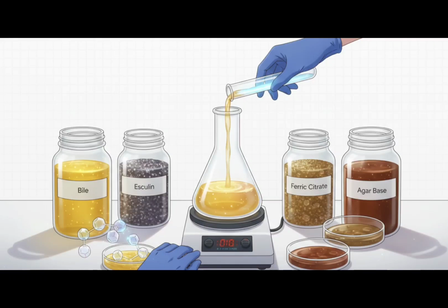It acts as a massive inhibitor, stopping almost all other gram-positive bacteria dead in their tracks. Only the absolute hardiest bugs survive this. Then we add ferric citrate acting as our indicator by supplying those iron ions. Finally, beef extract and peptone provide basal nutrients, and agar solidifies the whole shebang. It is a perfectly engineered, selective, and differential environment.